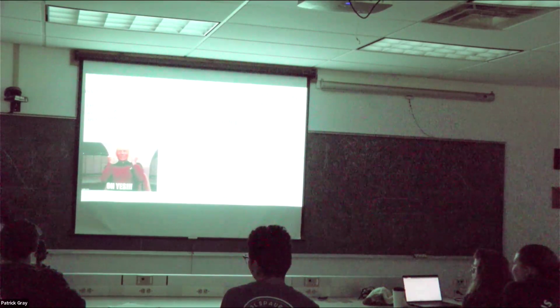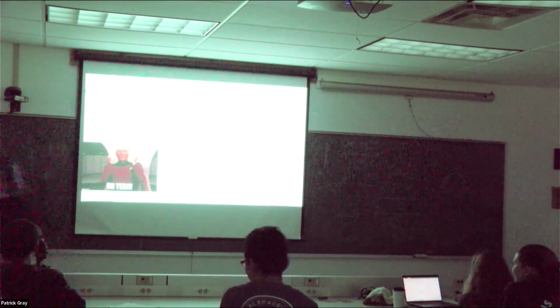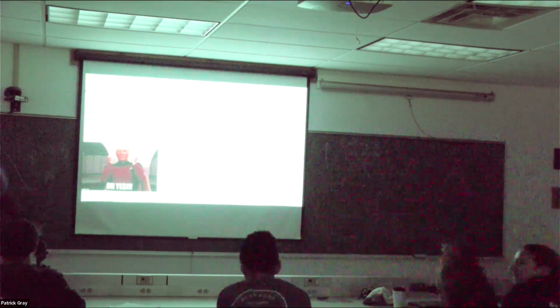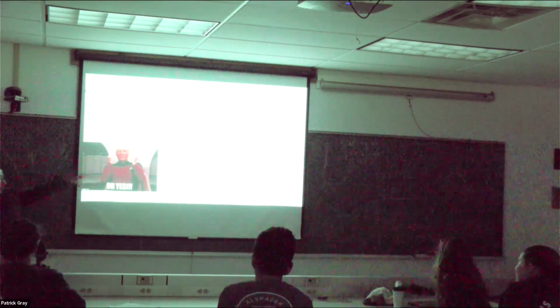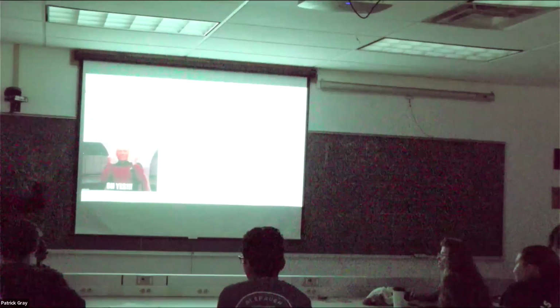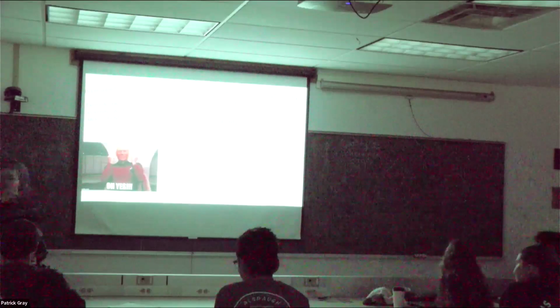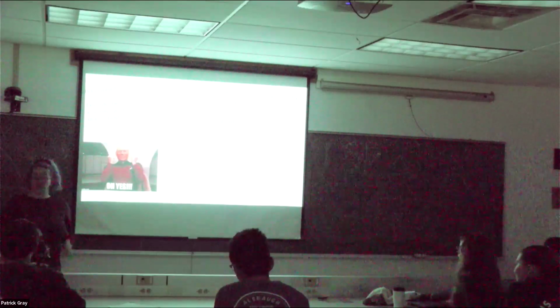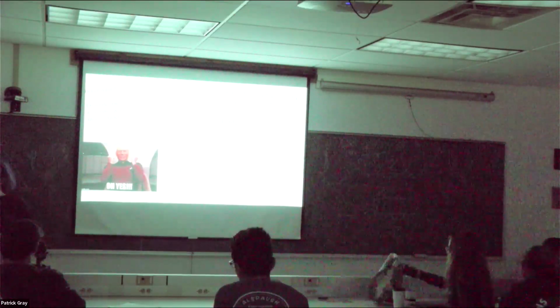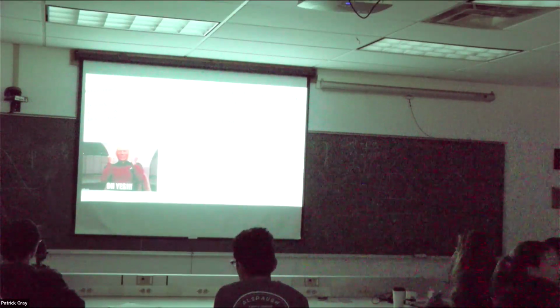So what are we going to do with that? We're going to use all the same methods, very similar volumes and so on. We're going to look at the variability, because you're going to be looking at uncertainties and propagating uncertainties. Looking at what is driving the difference, since you're all sampling at the same time in the same spot: is it natural variability, or is it you messing up along the way? Okay, so this is the first thing you're going to do.